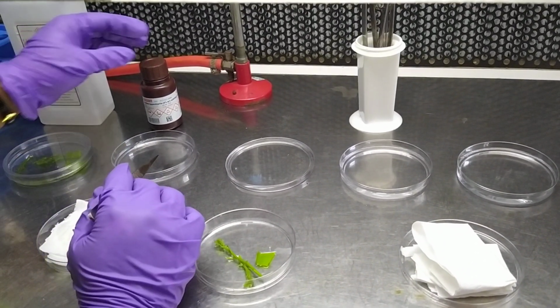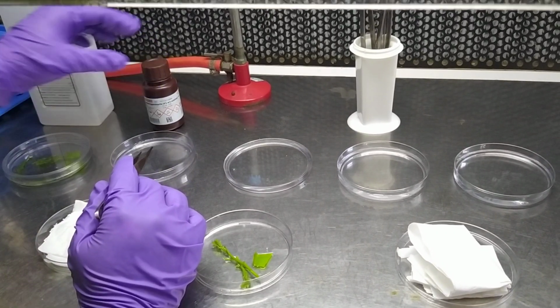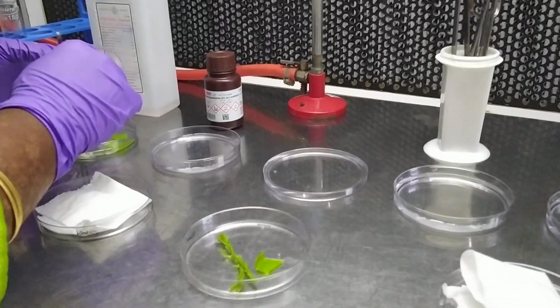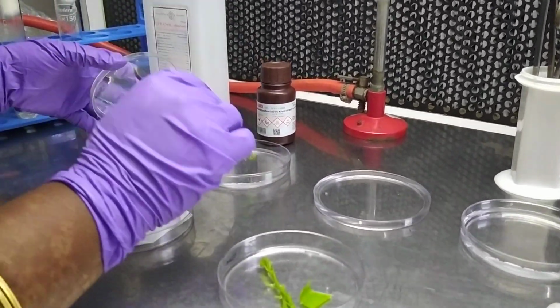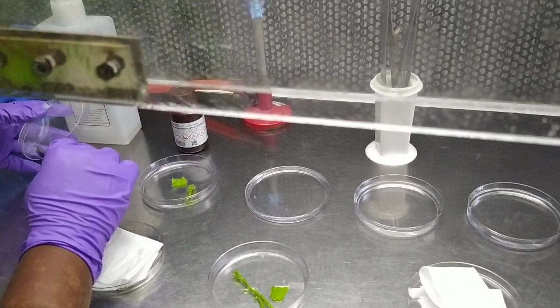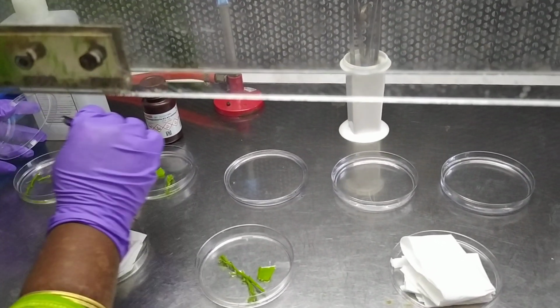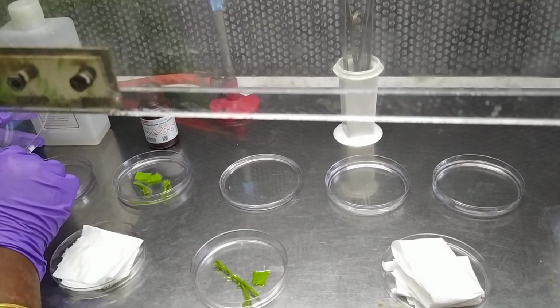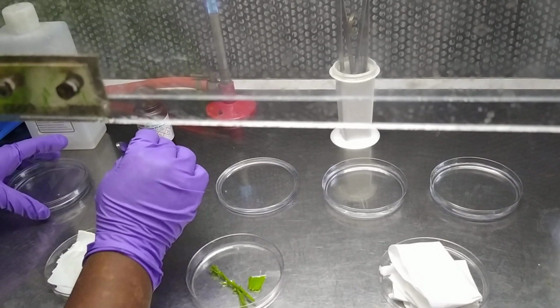For us, the available concentration is 4%, for which we could give around 5 minutes. I am taking the tissues from the alcohol and suspending them in sodium hypochlorite.